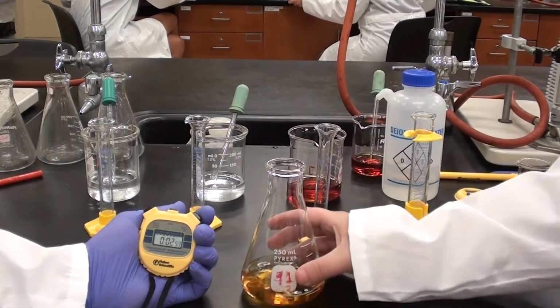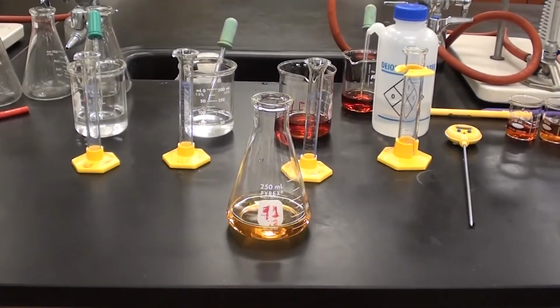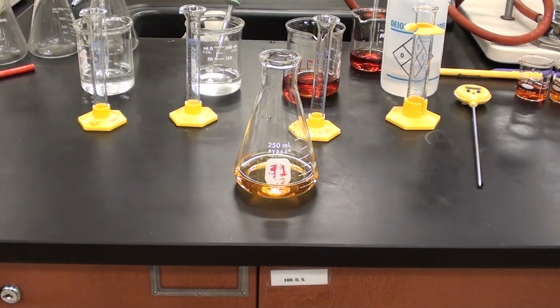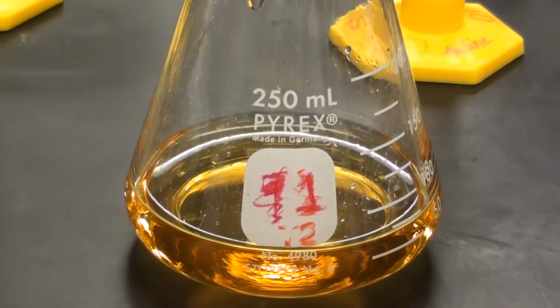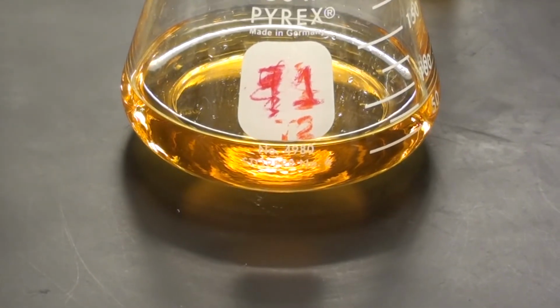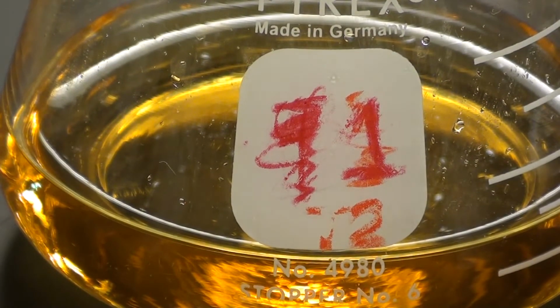Alright. Thank you, Samuel. What I'm going to do now is zoom in on the Erlenmeyer flask, sorry. What you'll notice about the Erlenmeyer flask was that it was dry at the start. And it's really important that we use a dry flask. Okay, just zooming in here. There we go. So you can see the color change in real time. I'm not going to speed this up, I'm not going to stop it. I want you to see the whole thing go.